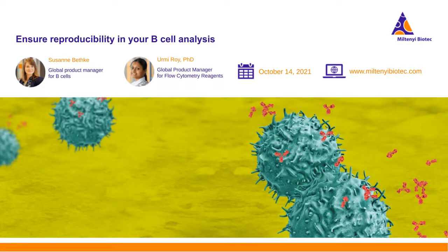And by this you can sort them, and with this cell sorter you really get very high purities, around 98%, and also viability in the range of 95-98%, which is really nice for these rare cells.